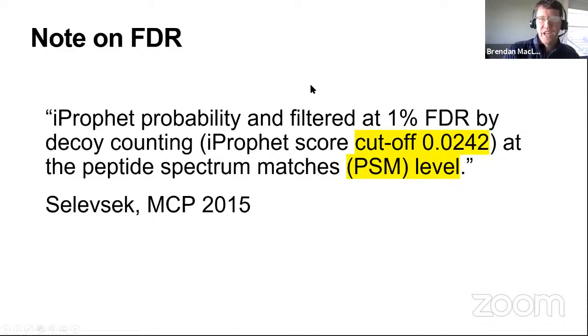It means that your search results are really good, but to get up to 1% FDR, you're throwing in stuff that's almost surely false. 98 out of 100 are false. Only 2 out of 100 are true. But we're going to keep shoveling stuff in until we get to 1% FDR, and that's going to make your counts higher.